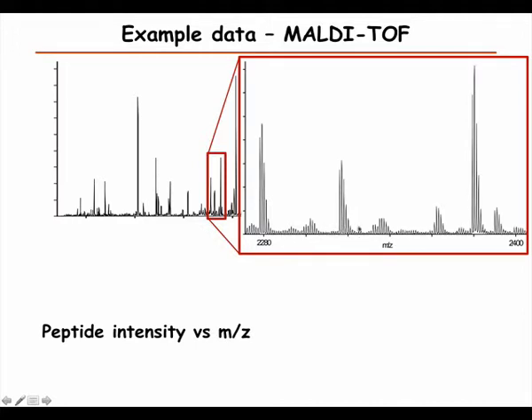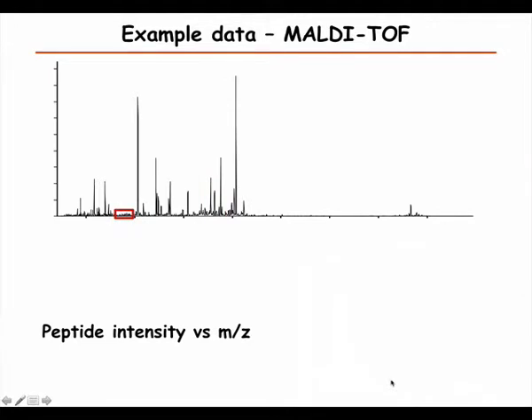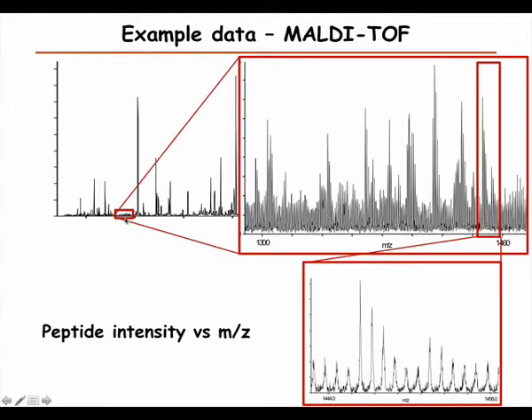that's at every mass. So if we look at this a little bit closer, we see that the actual noise is quite small for these peaks. We see a little bit of noise here, but we have then this more chemical noise that is at every mass. So even if you look at the region where the peaks look very small, we see that we have quite good peptides.